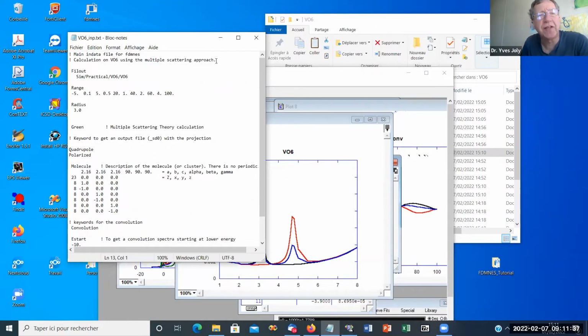Well, now let's go to things a bit less technical. What happens if we make some other distortion? We saw what happens if you have a Jahn-Teller distortion, so it becomes tetragonal, like in the copper oxide. But just for fun, we could, for example, try to lose the center of symmetry, because it's very often interesting to see what happens if you lose the center of symmetry.